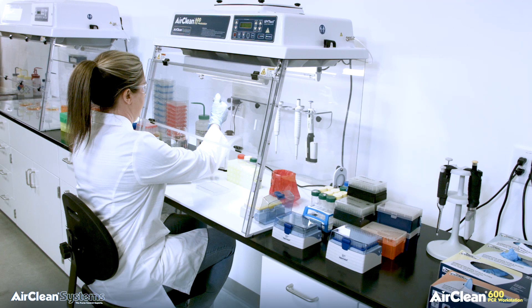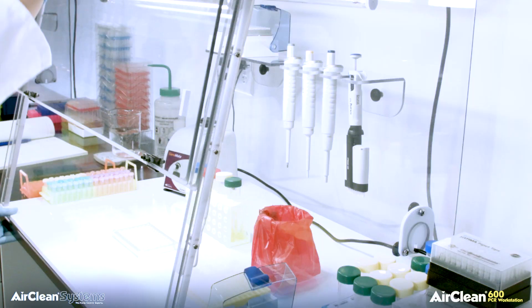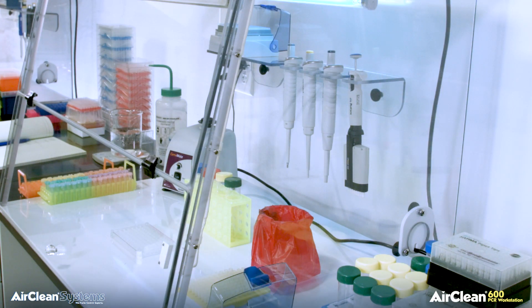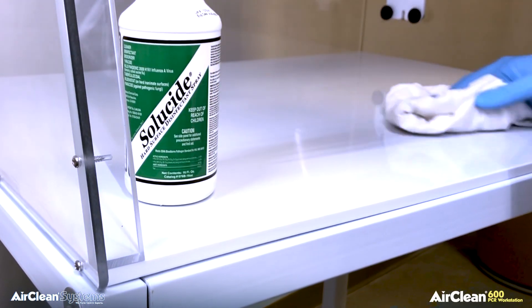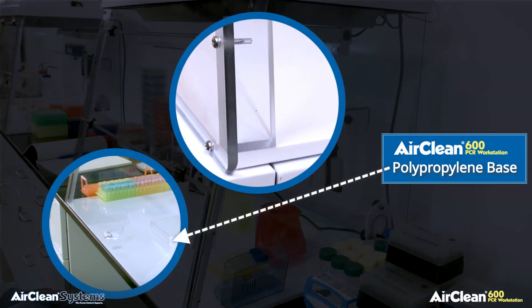The base is an integral part of the AirClean Systems Combination PCR workstation. Each base is made of a custom extruded polypropylene blend that not only reflects ultraviolet energy but also allows for easy cleaning between amplifications. Polypropylene is an ideal construction material for the base since it is impervious to typical cleaning agents and does not absorb moisture.